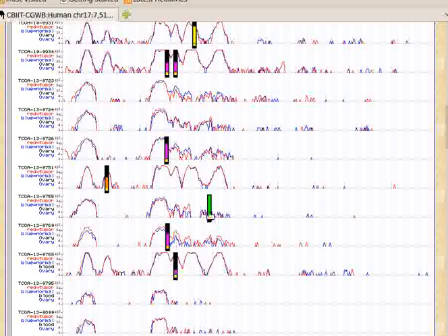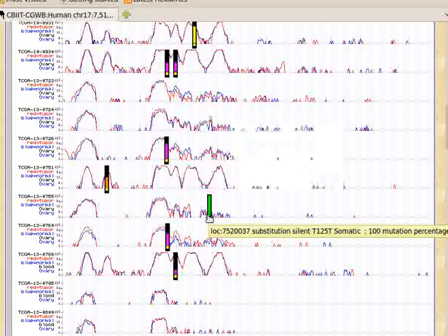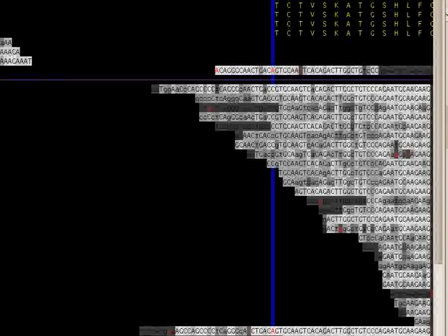Another way of looking at the use of next-gen sequencing data, like over here, this is a very strange mutation that's a silent mutation displayed by next-gen. If we look at the next-gen viewer, we are seeing this silent mutation is probably misannotated and really should be considered as a splice site variant. And again, we are seeing this one will appear to be homozygous changes across all samples in tumor, across all reads in tumor.